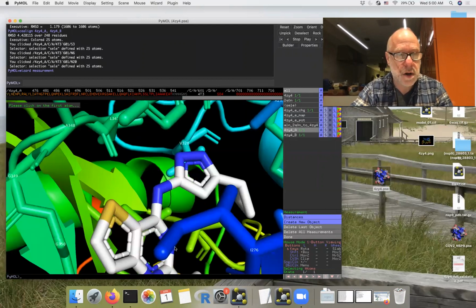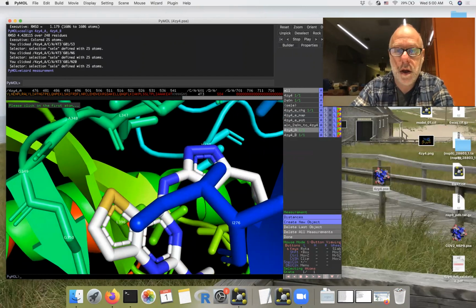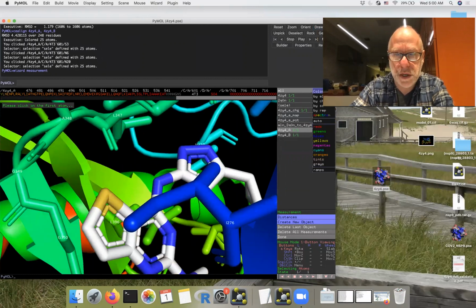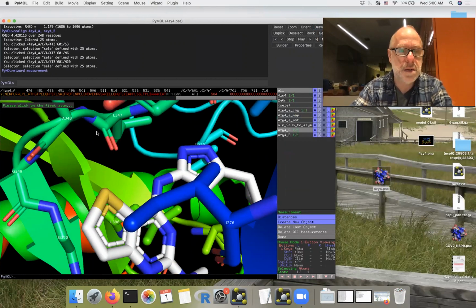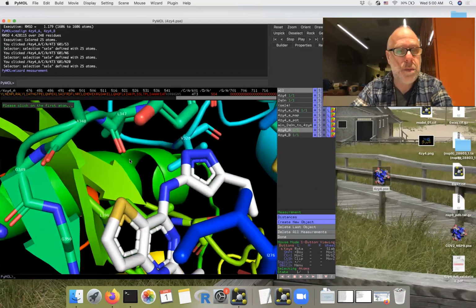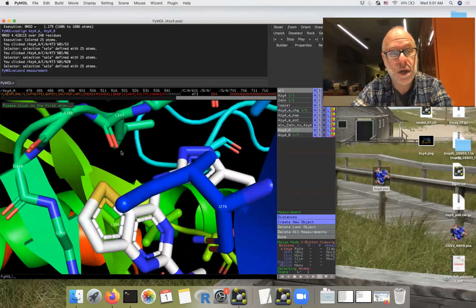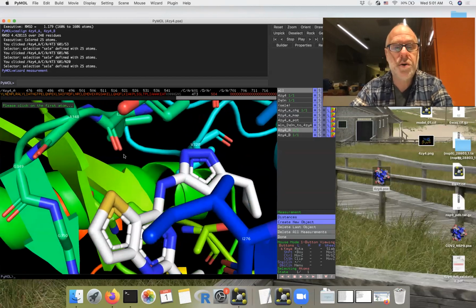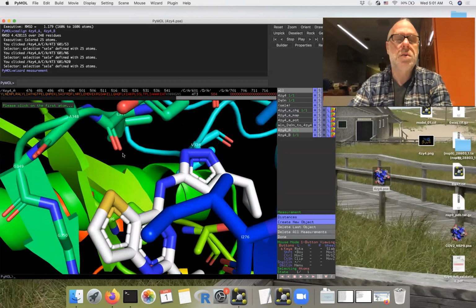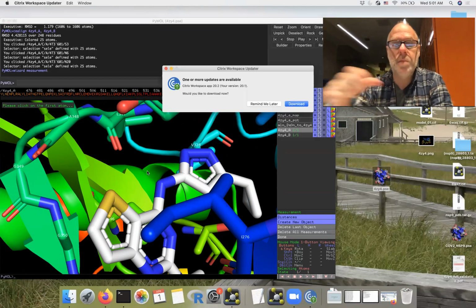So we're going to click on, what's a good atom to click on? Let's zoom in on our ligand and our residues around our ligand. I'm going to color all of the atoms in the entire structure by element, so that these sticks for the protein are now colored red for oxygen, blue for nitrogen. And I'm going to look for a hydrogen bond. Partly because I've been doing this a long time, I can spot pretty quickly what to me looks like a hydrogen bond. Actually, I can see a couple of them. So the distance in a hydrogen bond between a nitrogen and an oxygen, or between 2 oxygens, has to be about 3 angstroms, which is 2 carbon-carbon bonds.